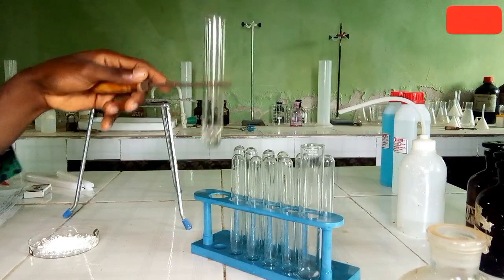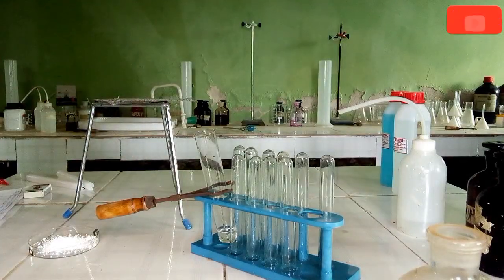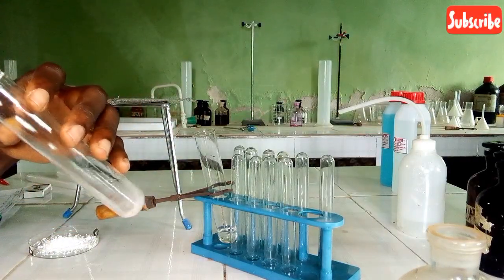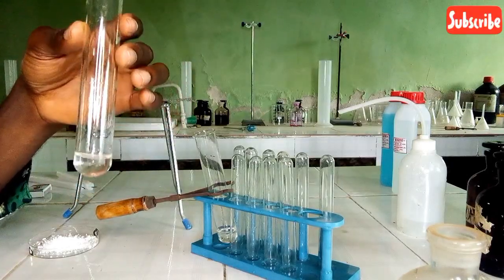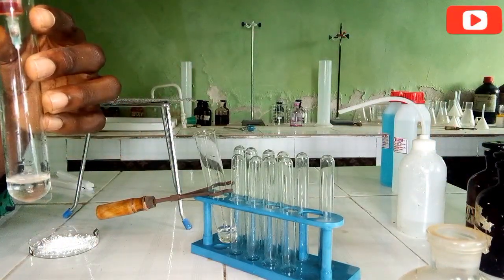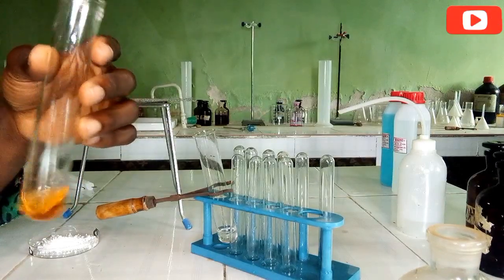So okay, let me keep this, rinse this, then I make another portion. So let me make another portion of it. Just like it dissolves, you can see it now. So now let me add my K2Cr2O7. So this is it. Let's add it in a little amount first to see the changes.